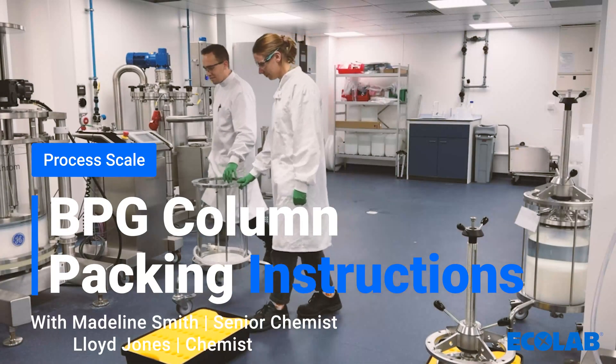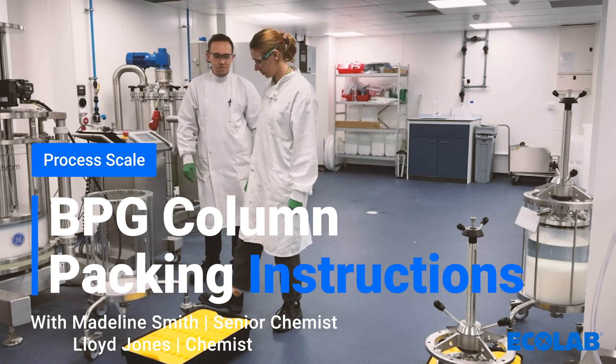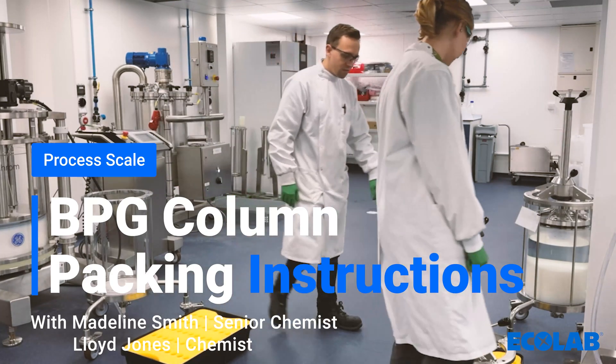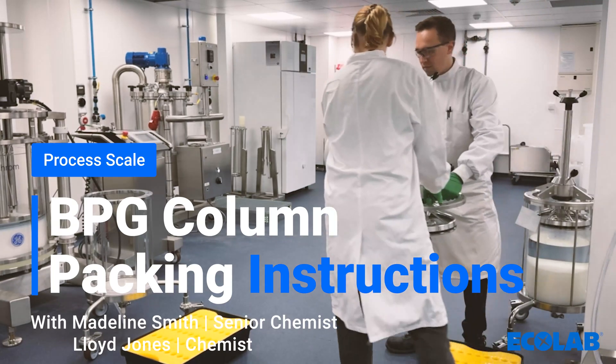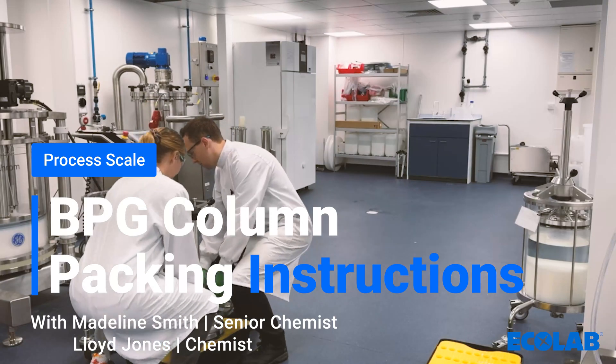Welcome to this instructional video on packing process scale BPG columns with Protein A resins. Proper column packing is crucial for achieving optimal purification performance in your downstream processing. In this video, we'll guide you through the step-by-step process of packing the BPG bioprocess glass column with Protein A resin.